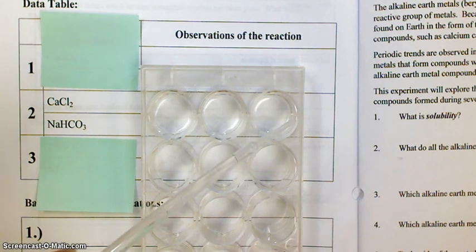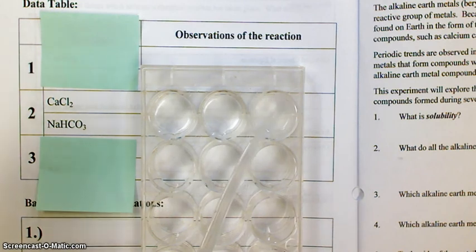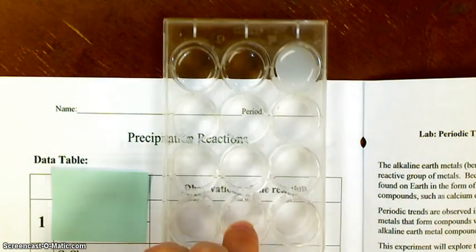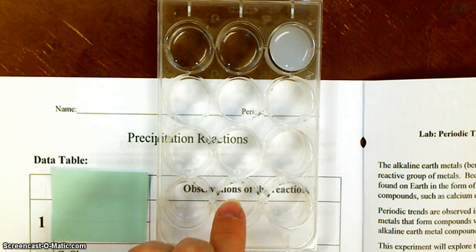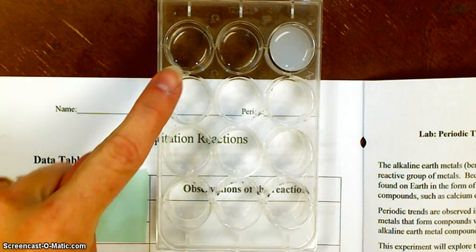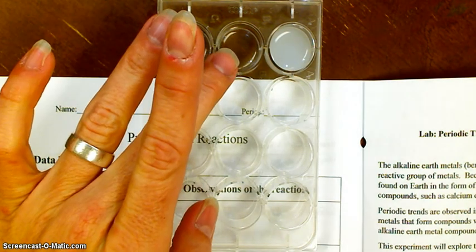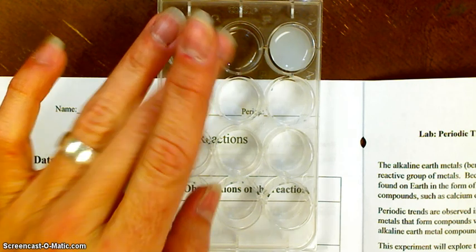Okay, and now I'm going to put the calcium chloride over here. And it may look like nothing's happening, but that is because it's hard to tell on a white background. So let me move this. Can you see now that something's happened? Because the calcium chloride solution was clear, the baking soda solution was clear.